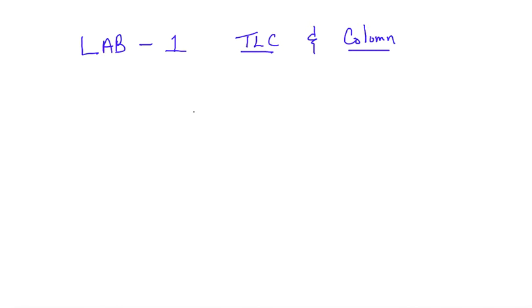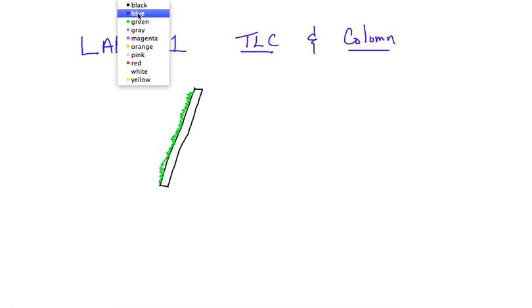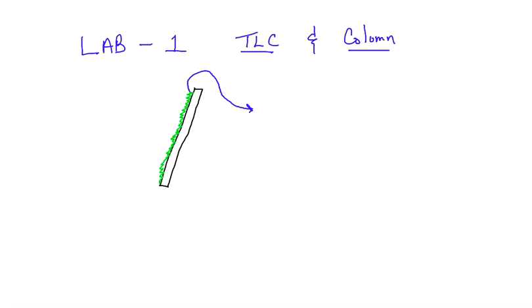In TLC, we had a plate. Now, if I look at the side view of the plate, okay, I had a silica backing. So let's make that just green for fun sake. And we'll say that that green backing is definitely due to a silica. Now that silica is basically silicon, or the element silicon, and it's bonded to some oxygens that have some negative charge to them.